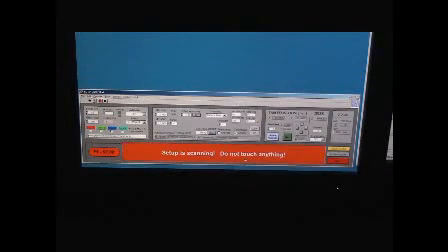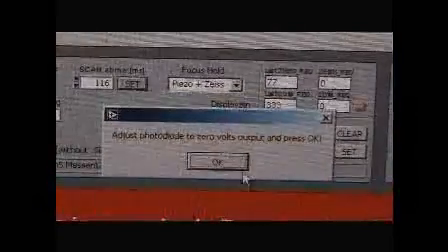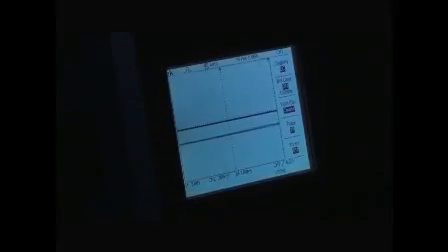The back-reflected laser beam is imaged on a 2-segment photodiode, and the differential signal is used to control a Z piezo for fast refocusing. The reader is equipped with an automated focus hold system operating during the scanning process. With one scan at 488 nanometer for selective excitation of GFP, the second scan at 647 nanometer for selective excitation of Cy5.